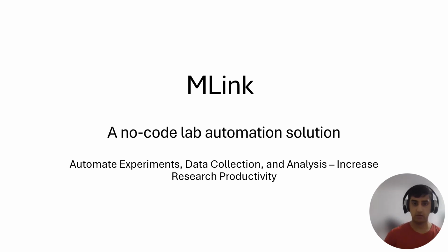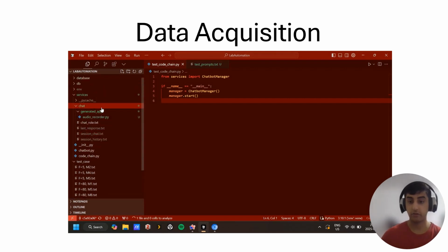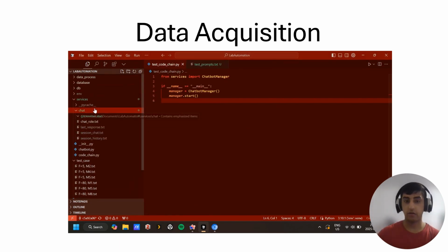So I decided to take the software solutions I've developed and turn them into a product that other researchers can also use to become more productive and get more things done. So here's a demo video that I would like to show. So here is an example of how you can use the software.